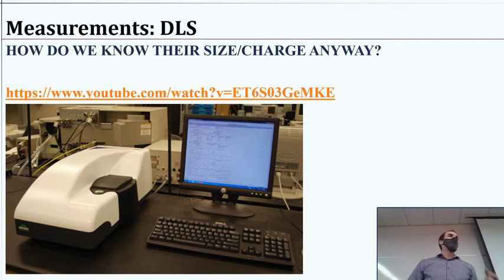It actually goes through and touches on a lot of what we just talked about, and also helps introduce how we use the same technology, or very similar, to understand particle charge in solution. Because with all this coagulation and particle stability we've been talking about, the size and the charge have been very important, but we never really talked about how we know or find that size.